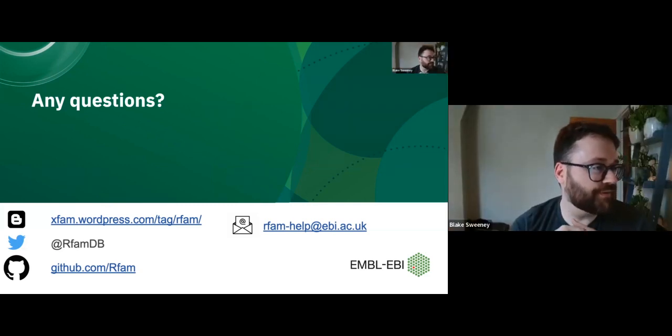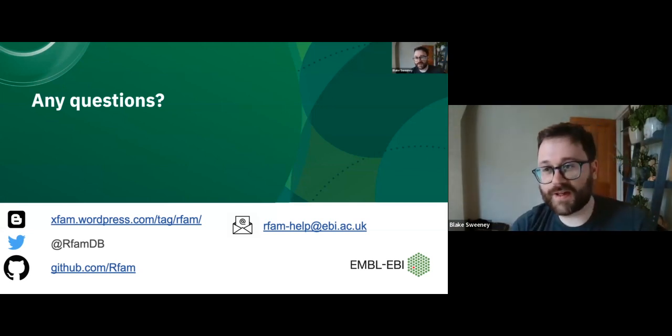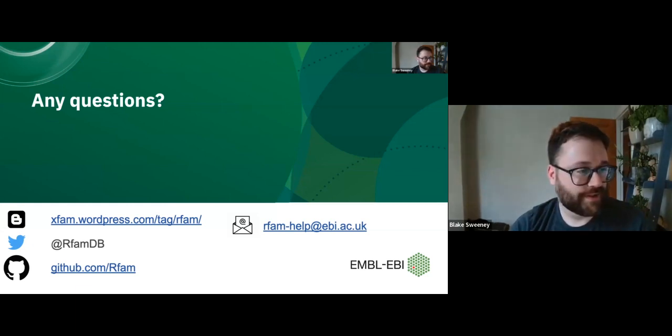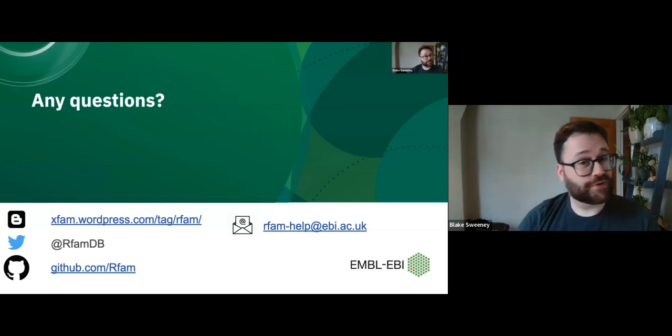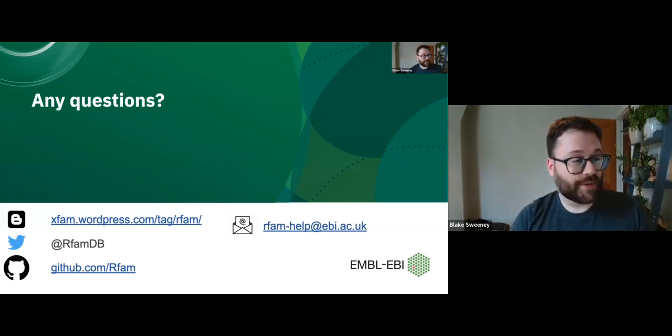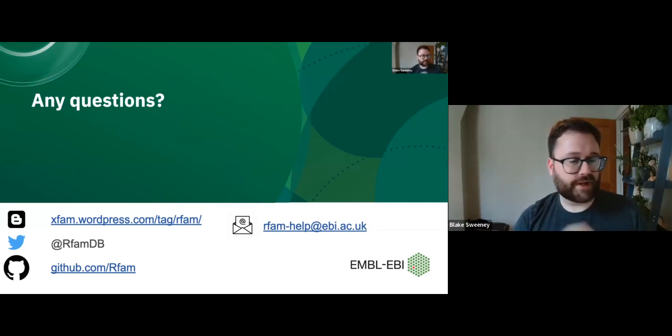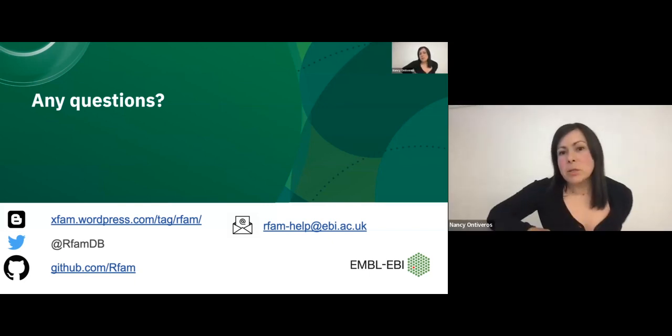There's a question: have there been cross-validations of secondary structures against experimental evaluations? Do we receive a reference for the origin of the secondary structure? I can answer that a little, and then maybe I'll ask Nancy to expand. The secondary structures are generally provided to us by an author, so they hopefully have some experimental support. In addition, we track the source of the secondary structure in the Rfam families. That is available on our webpage in the curation tab, and can be fetched by an API or downloaded in various ways. But maybe Nancy can add a bit more about the 3D and other practical aspects.